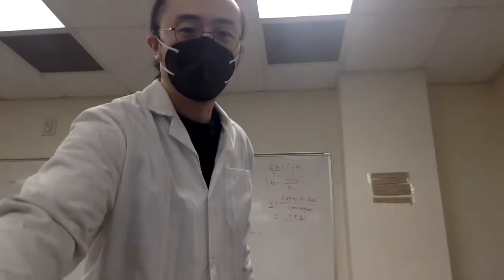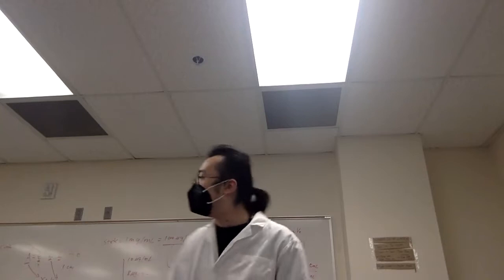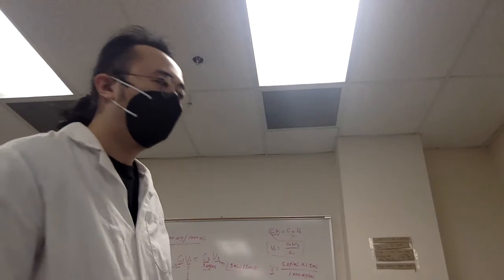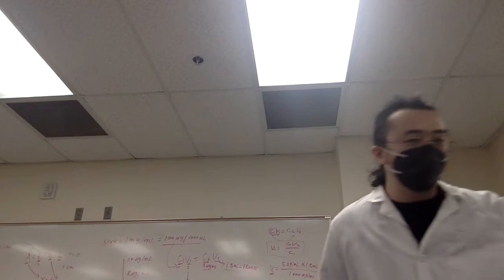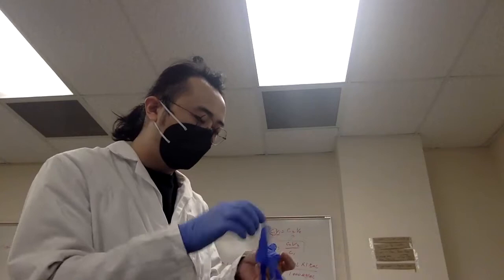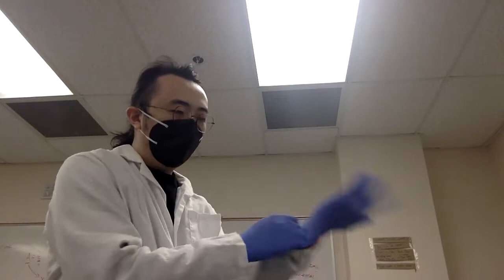All right, so today's lab is basic techniques. The most important thing here for today is to teach you how to use pipettes. So in the lab, before we touch any chemicals or instrument, wear your gloves. Pipettes are a very, very useful tool in a biochemical lab. It basically helps us to transfer a small amount of liquid.